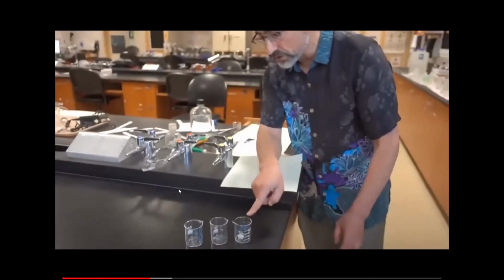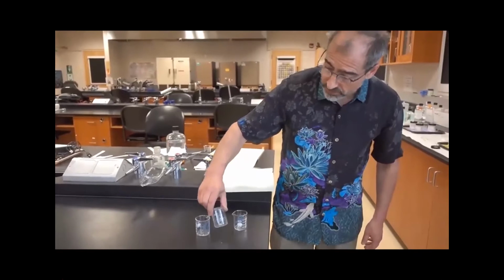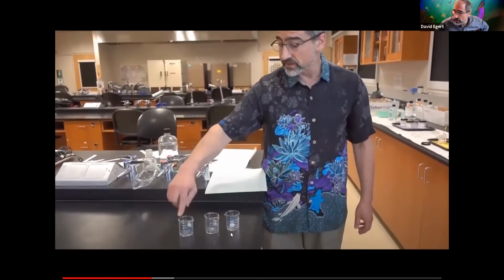All right, so as we're doing this, you should write down in your lab notebook an actual observation. While you actually see it on the screen, you can describe what it looks like. You can also use the version of me helping describe it as well. But in your lab notebook, you do want to record what these look like before we do anything else, just as the little crystals sitting in there. This one is potassium chloride. This one is the calcium chloride.